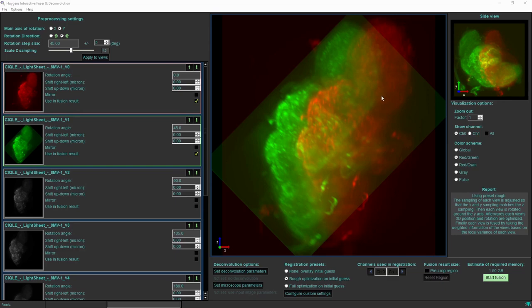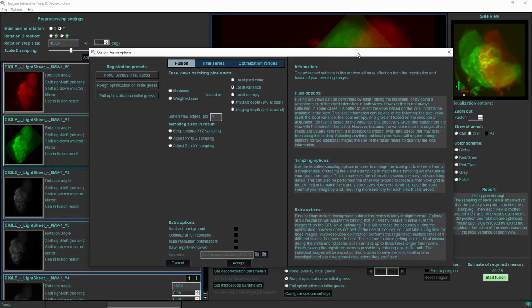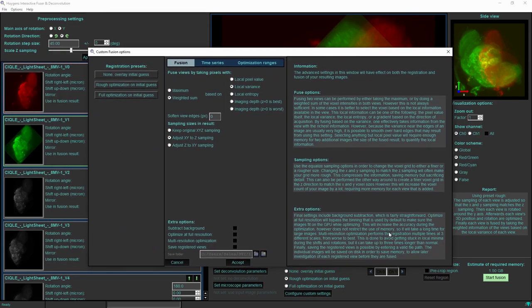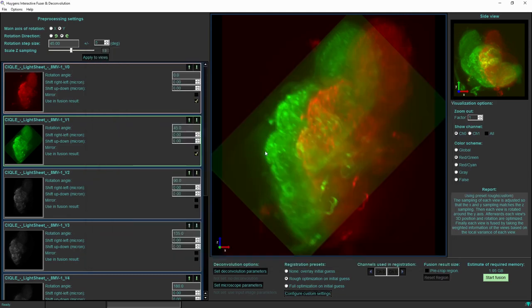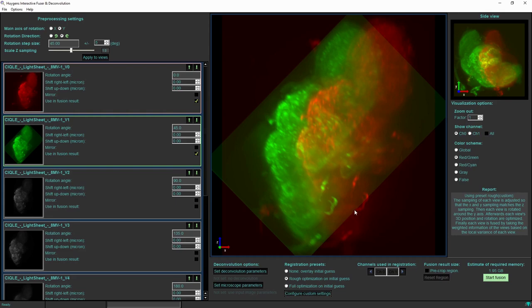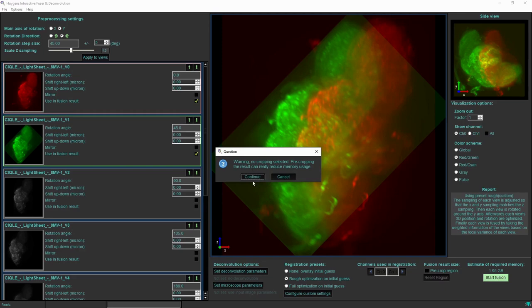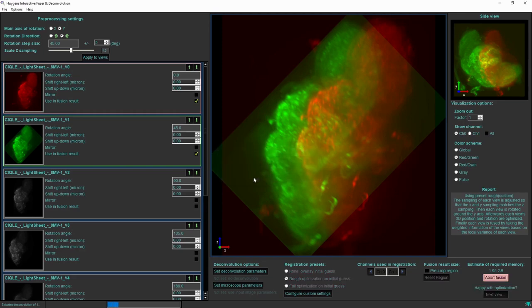Now if we would be doing a full deconvolution on each of the input images, the background would be removed. But even if we don't do that, the background can also be removed just in a fusion process by selecting this option subtract background. I would also like to show the effect of the multi-resolution optimization, so I will accept those two changes. Then without manually overlaying the two input views this time, and also without selecting a crop region, I will just start the fusion process on two input images.